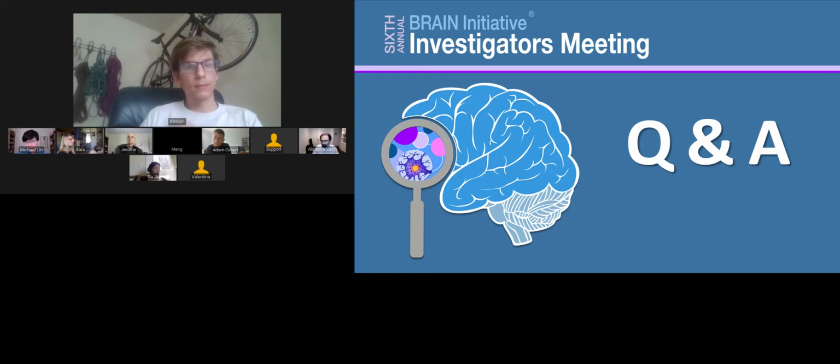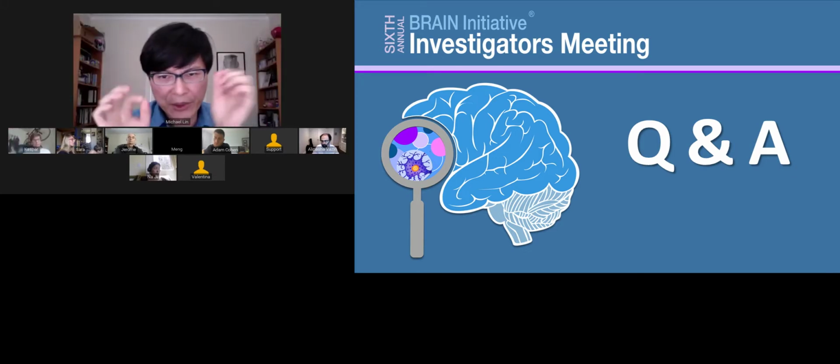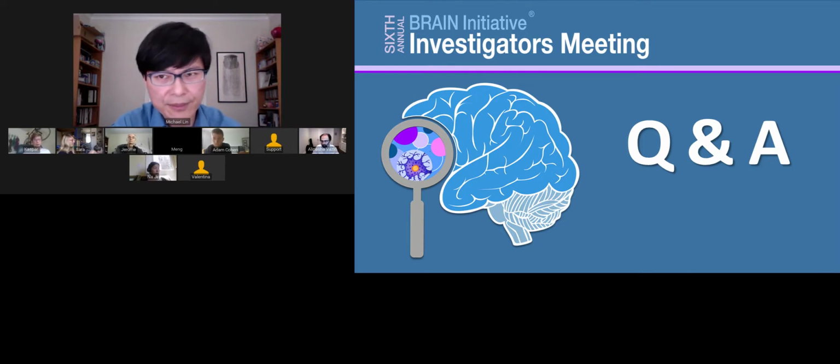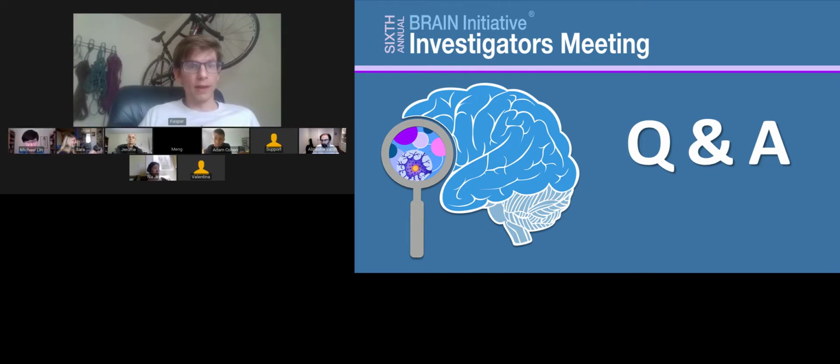Right, I see. So basically, you're using the DMD as a mask with little holes in it, and then you're putting a laser line across it quickly, like this, right? Yeah, and Adam's lab has done a holographic analog to this recently with an SLM, where they addressed rows or columns of an SLM and then had a 1D hologram. Conceptually there are similarities in this approach, where you combine the programmability of an SLM or a DMD with the fast access time of scanning a laser line to a spatially distinct point. And so that's what gives you the fast access time. That's great. That's very elegant.